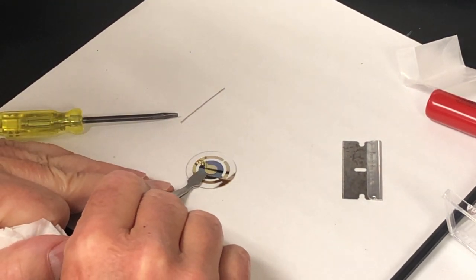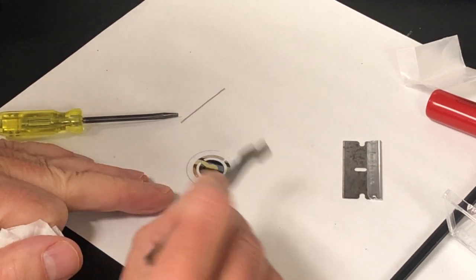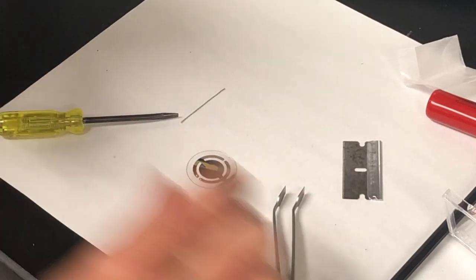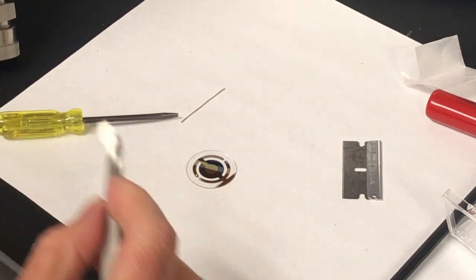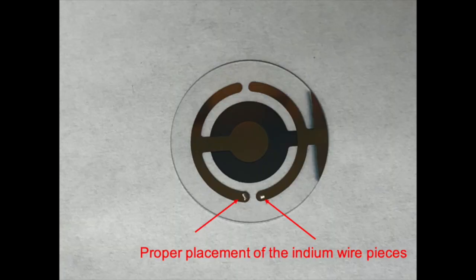And now we use the flat tweezers to carefully smash down the indium so that it flattens slightly and sticks to the crystal. Do not press too hard or you will crack the crystal. Here is what the smashed indium wire pieces should look like.